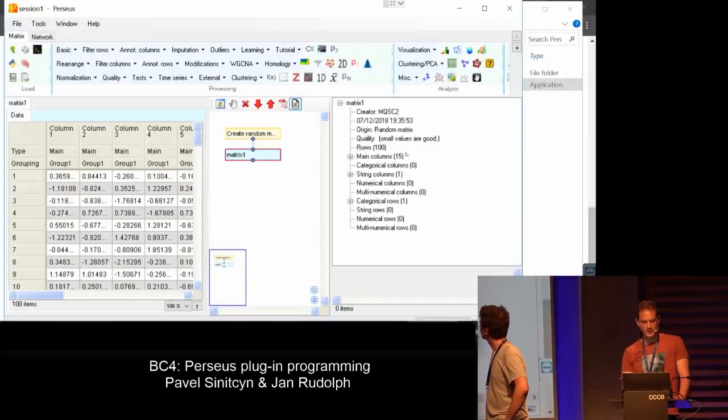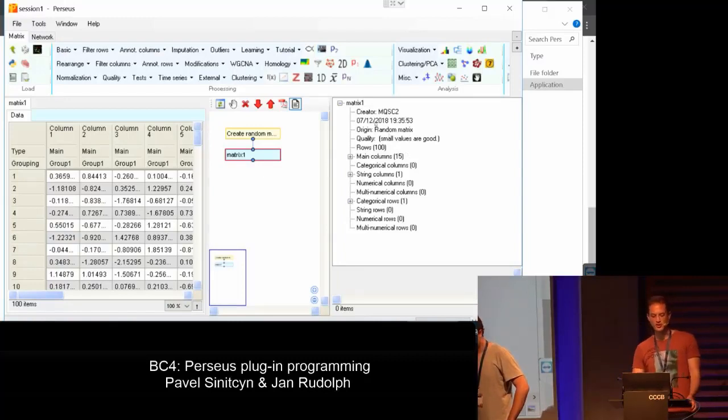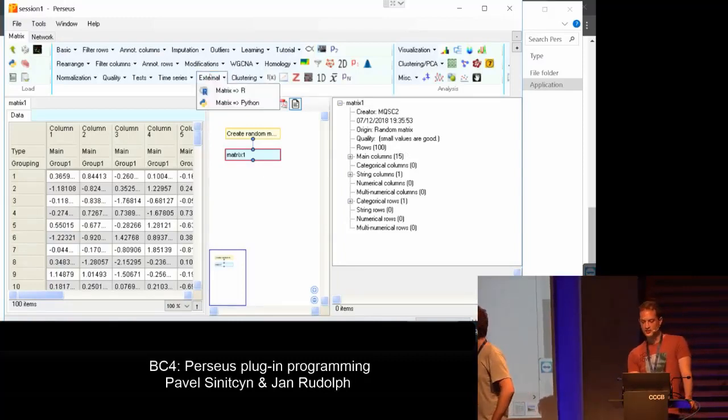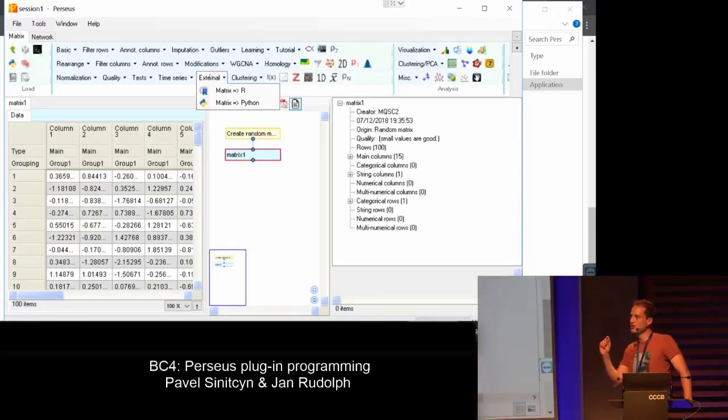So there's a very generic plugin that allows you to run your scripts without having the buttons. If you want the buttons, then you have to do C#. If you're fine without the buttons, you can use something more generic, for example this external. It's going to be something like clone, no? Without any buttons. If you want a separate menu entry for your plugin, and the button or the image is optional, you always have to program it in C# for now.